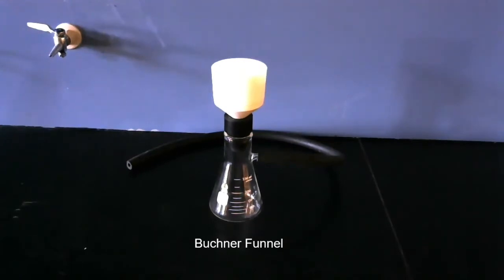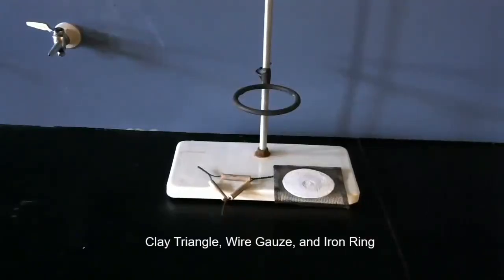Here on the ring stand you can see the iron ring. You can use that for mounting things onto the ring stand. You can see the clay triangle there to the left, and it would go on there and hold things like crucibles. If you need to heat something like a beaker over a Bunsen burner, you would use the wire gauze and put it over the ring.